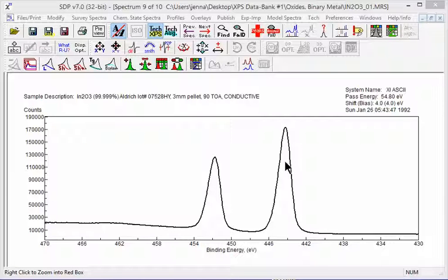This is a 3D species signal, so it's a 6:4 ratio, or if you reduce it, it's a 3:2 ratio, or a 1.5:1 ratio for the peak area ratio. That's the theoretical peak area ratios.